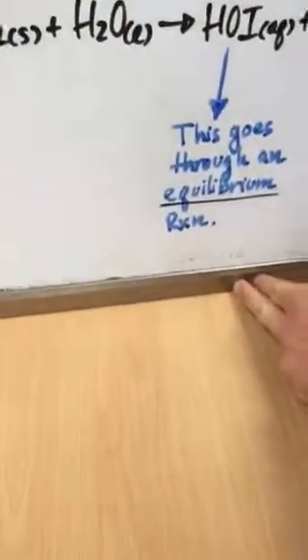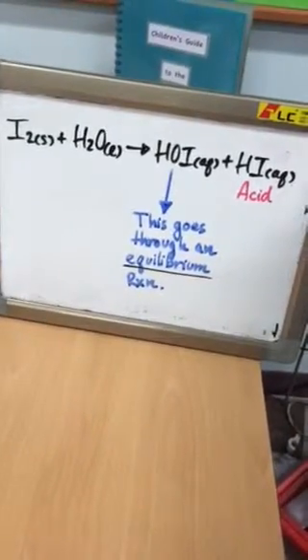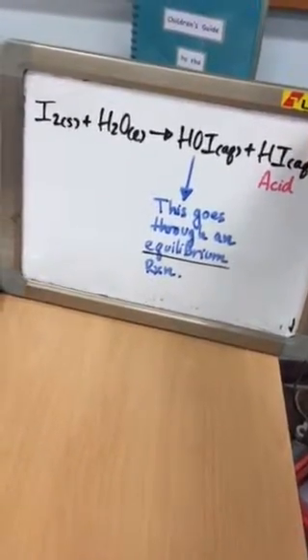We'll back this up so you can see it. You can see this reaction as well. And we'll talk about this reaction. That actually produces a small amount of acid when it goes through an equilibrium reaction. But we'll talk about equilibrium at a later time.